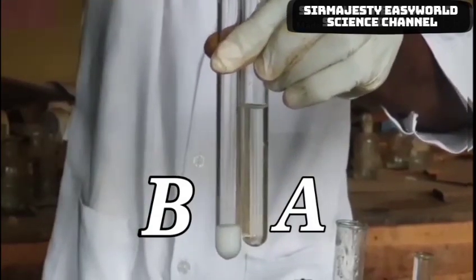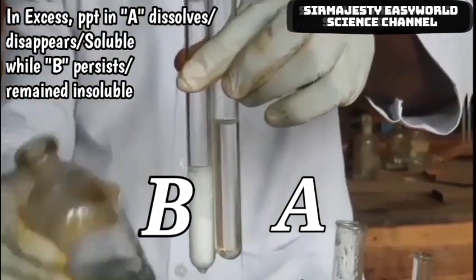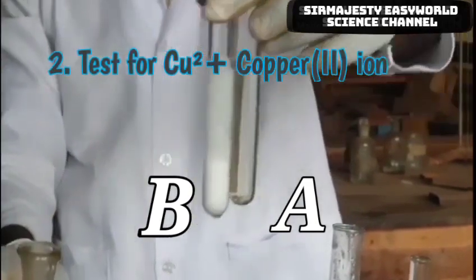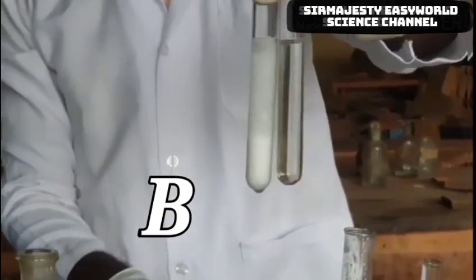Then in excess, you are checking if the precipitate formed will dissolve. As you can see, test tube A dissolves on adding in excess. This one is test tube B — the precipitate persists on adding the reagent in excess. So in A the precipitate disappeared, and in B the precipitate remained.